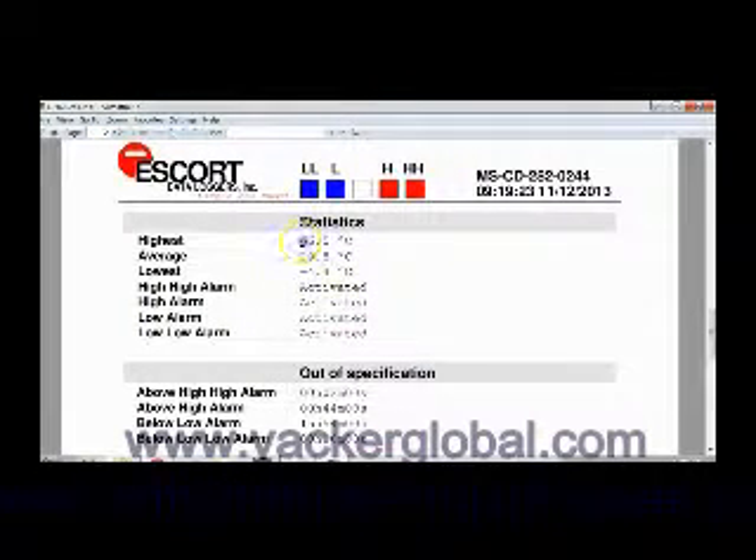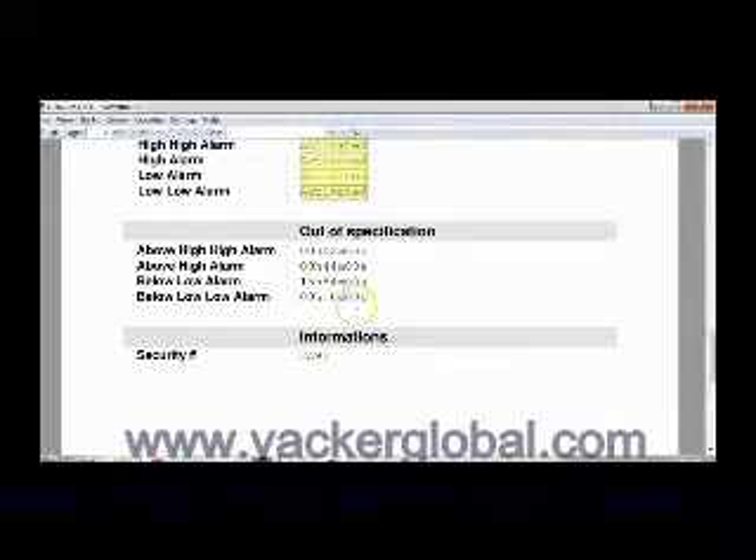Here you can see the highest and lowest temperature during the recording period. You can see that all alert levels were activated. Also the duration for which these temperatures were exceeded can be seen here.